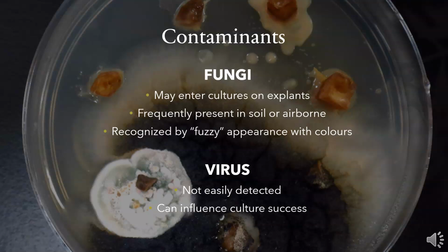Fungi may enter cultures on explants as plant pathogens. They are frequently present in the soil, or their spores may be airborne. Fungi can be recognized by their fuzzy appearance, and occur in a variety of colors.